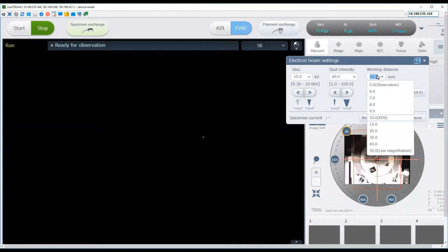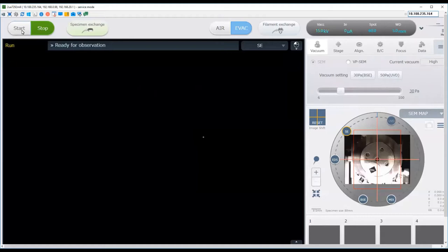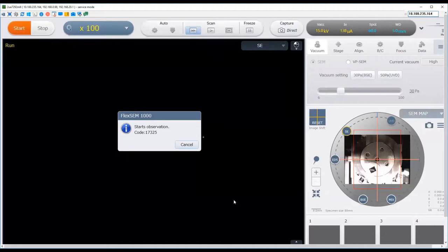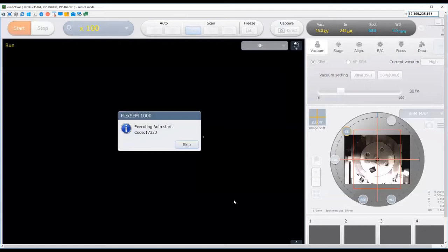The working distance is effectively where the beam is focused. Bring it back to 5, which is typical for imaging. If you are doing EDX, set it to 10 and move the stage down to 10 as well. For SEM imaging today, set this to 5. Close the electron beam settings dialogue, then come over to the start button and click start. This will start up the beam — you'll see flashing lights on the instrument as it focuses the beam onto the sample and attempts to give you an image.